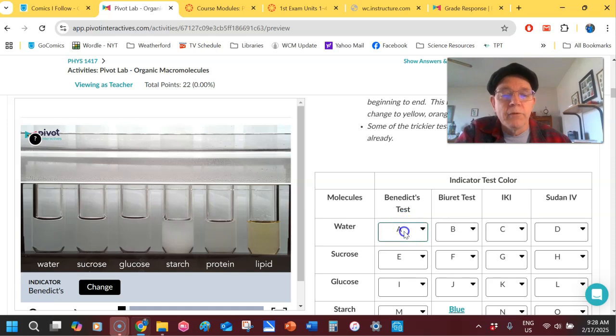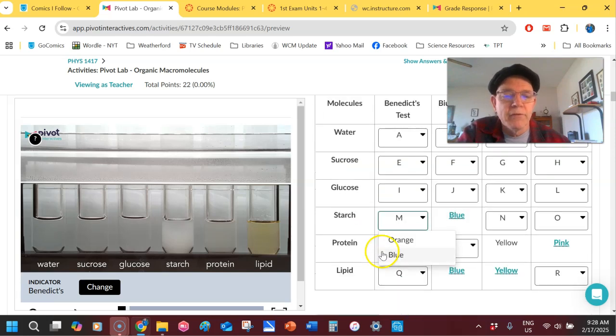So for water, you would say, okay, what color was it after that test? The Biuret solution, what color was it after the test? And the iodine, potassium iodide, and the Sudan 4. And you would do that for each of the solutions. So if you did the Benedict's test, then you could do, boom, what color did it turn? What color did it turn? What color did it turn? It's going to be the same 2 colors. Those are your 2 choices.